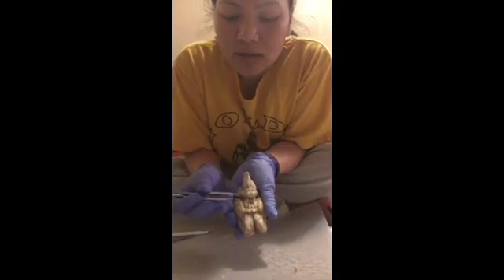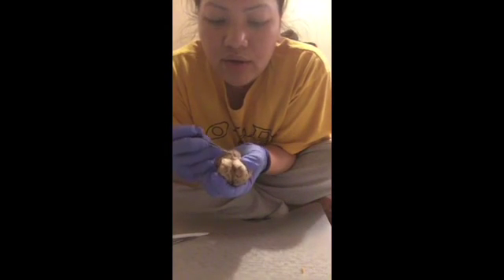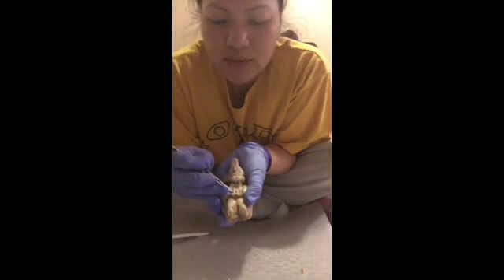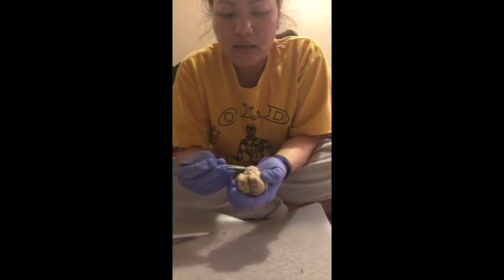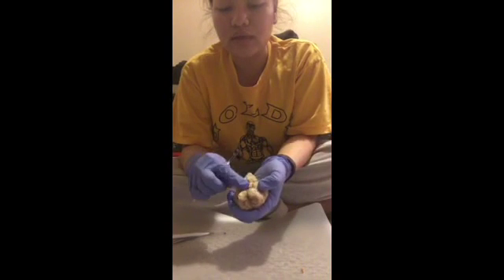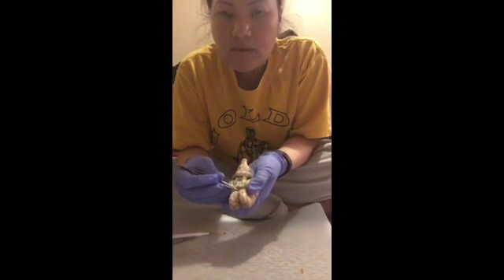The superior colliculi is this part, the top part. The inferior is right here. That's hard to see, but it's right there. That's the inferior colliculi. And the pineal body is located anterior to the colliculi. So it's right here. Right there.